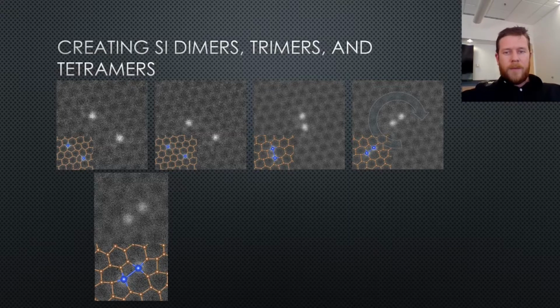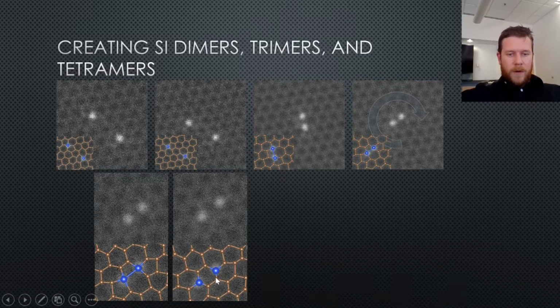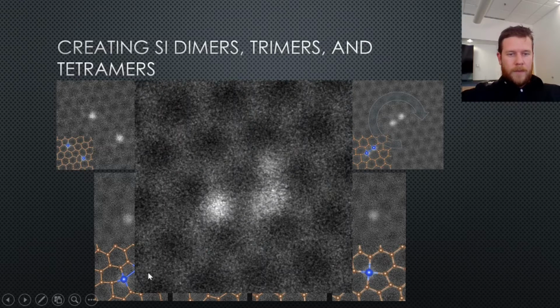So I took a 10-frame stack of images, and it turns out I was actually able to capture in this 10-frame stack a little bit of atomic chemistry going on. So in the first frame, we have just this initial structure. Here it is. And then shortly thereafter, it captures 2 carbon atoms, and the lattice heals, returns back to hexagonal symmetry. This guy moves down 1 here, and then this one is knocked from the lattice, and this guy assumes fourfold coordination. So here's the video.